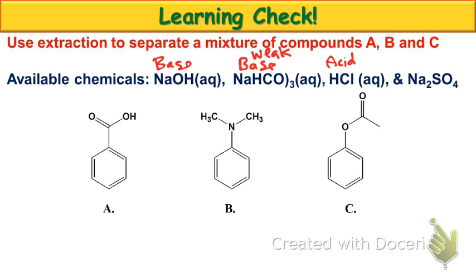And sodium sulfate, it's a really weak, or actually it's not even an acid. We don't have hydrogen ions on sodium sulfate to have it act as an acid. So it can't be an acid. It's a really, really weak base, so weak that we don't say it even acts as a base. So why is it there? Someone said it. That's our drying agent. Okay? Why is it on this list? Confusion. That's it.